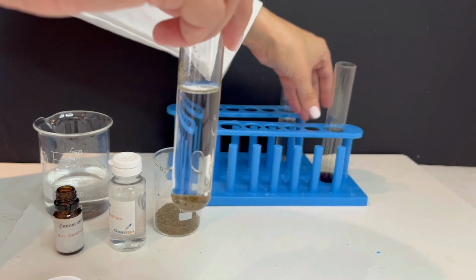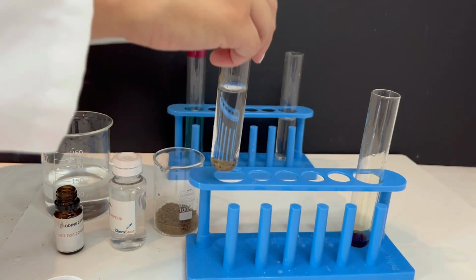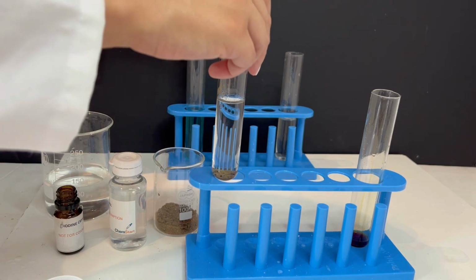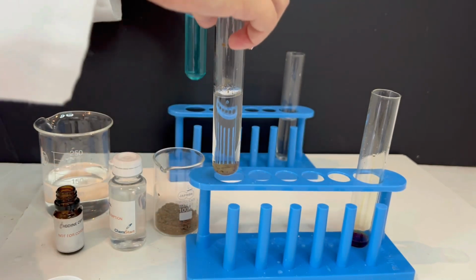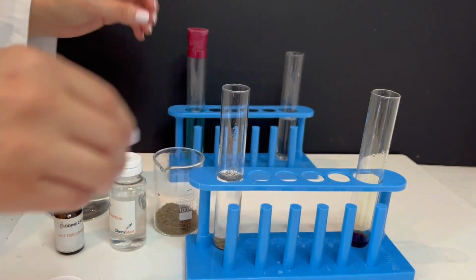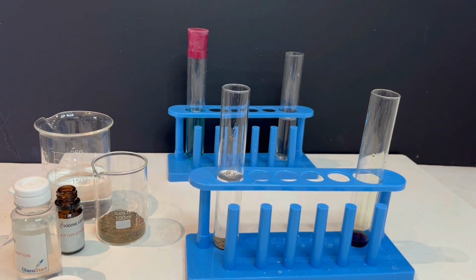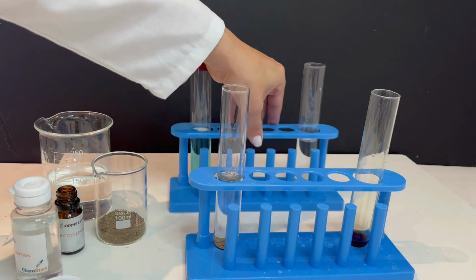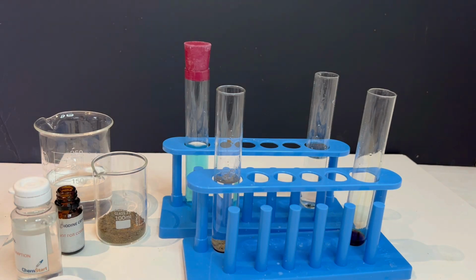In the first test tube, the sand and water form a heterogeneous mixture because we can still see the different components. In the second test tube, the copper sulphate dissolves completely, forming a homogeneous mixture. In the third test tube, the iodine crystals only partially dissolved, creating the heterogeneous mixture. And finally, in the fourth test tube, the iodine dissolved fully in ethanol, resulting in a homogeneous mixture.